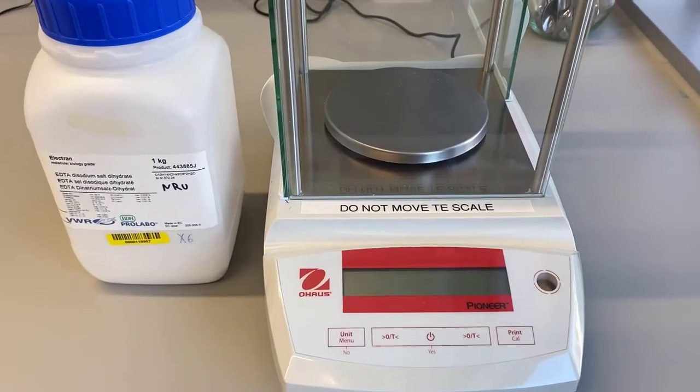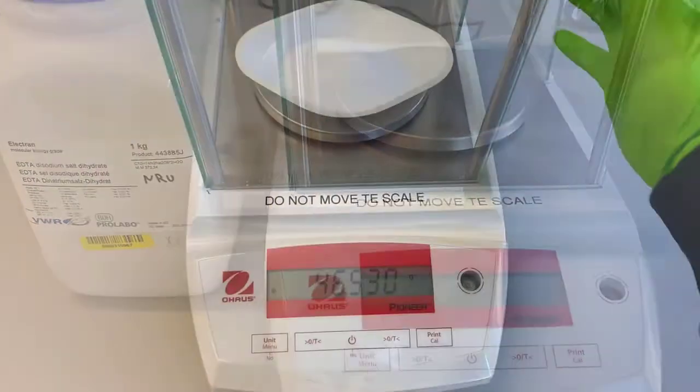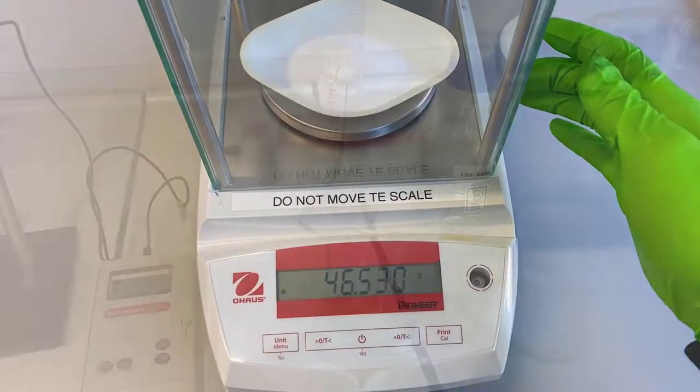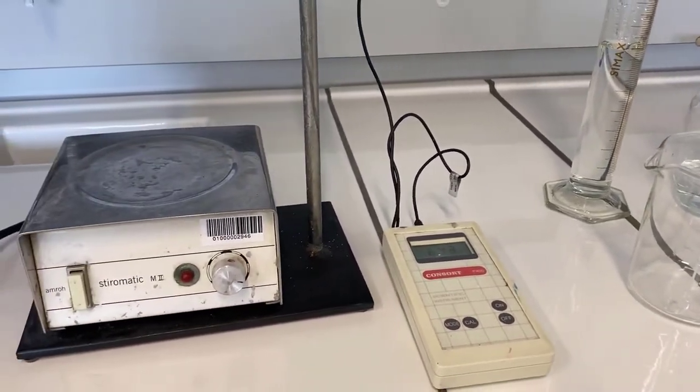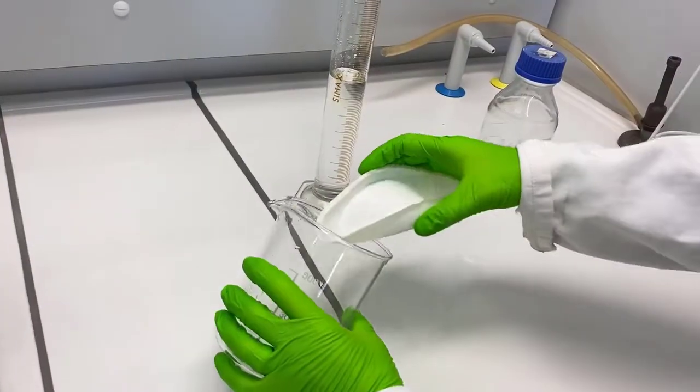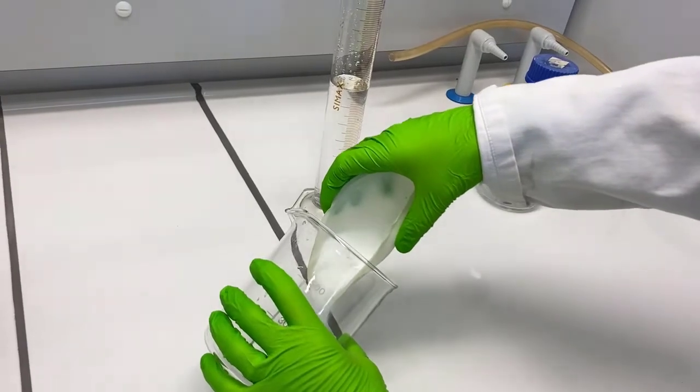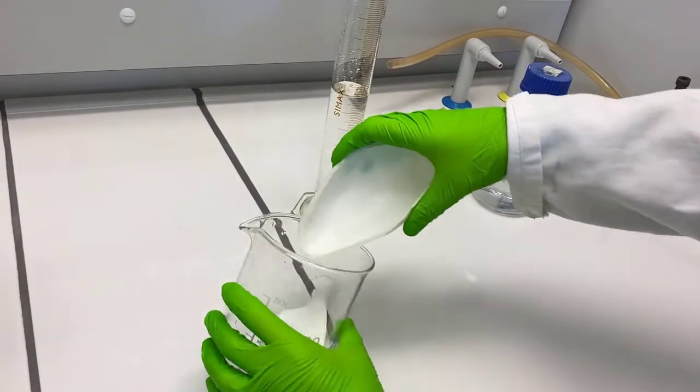Now let us first weigh the required EDTA powder to make our 250 ml of 0.5 molar EDTA. Now assemble all the requirements in a fume hood, and then dissolve the EDTA powder in about 150 ml of water first.